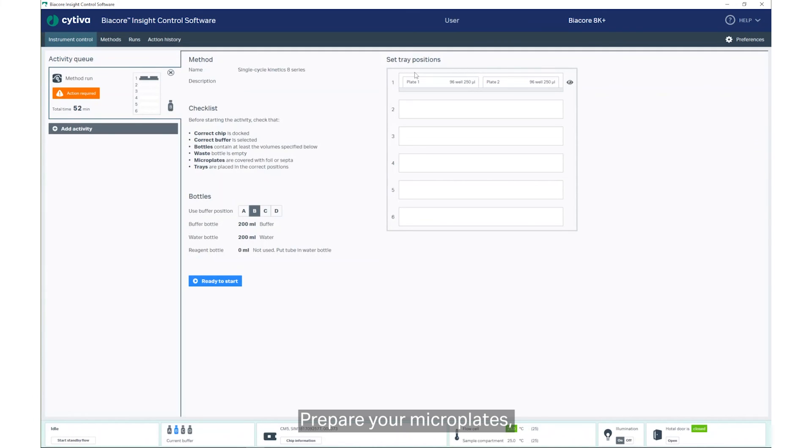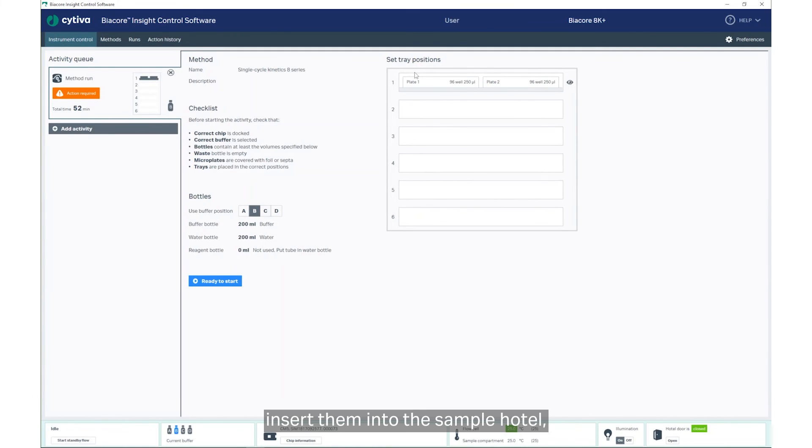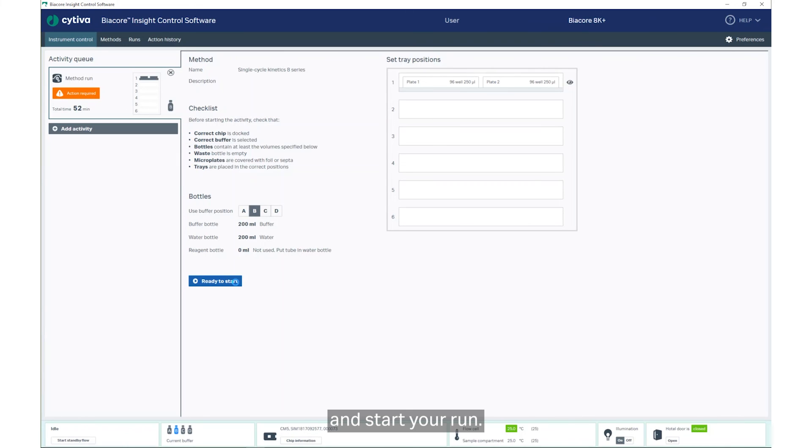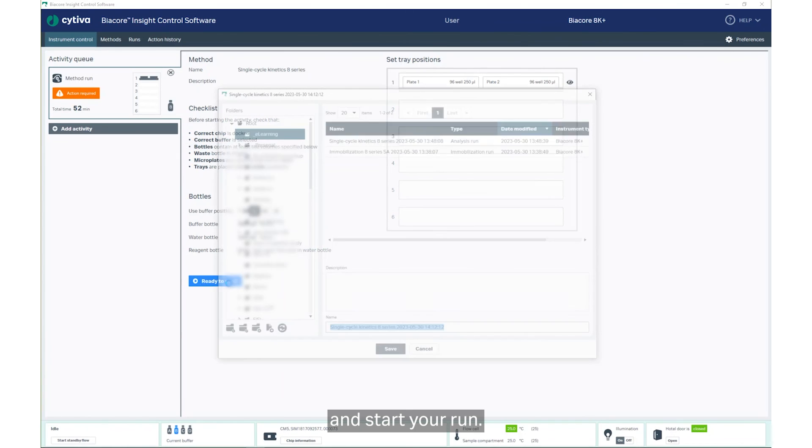Prepare your microplates, insert them into the sample hotel, and start your run.